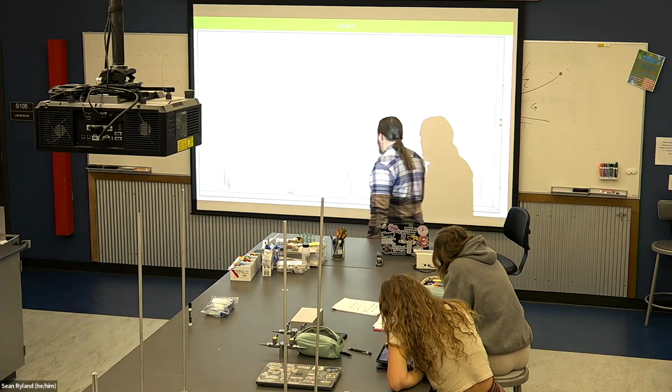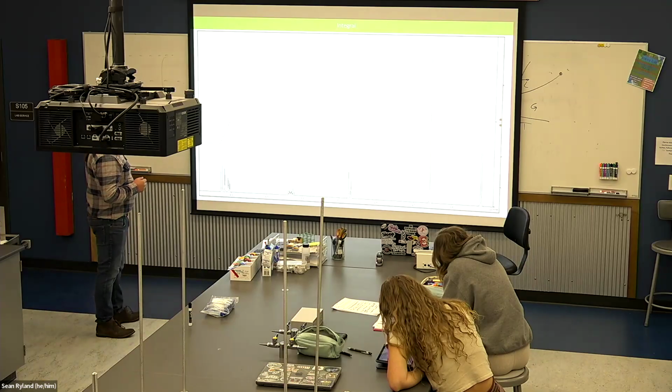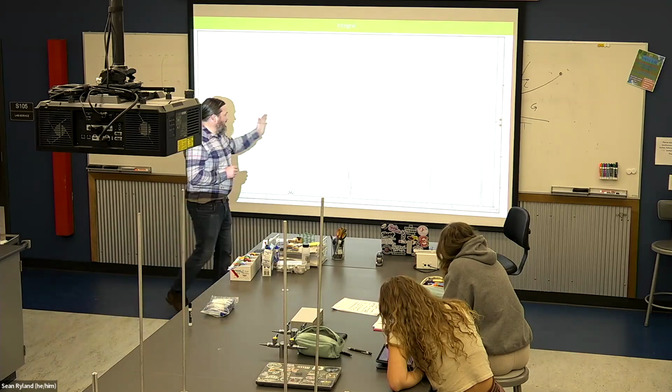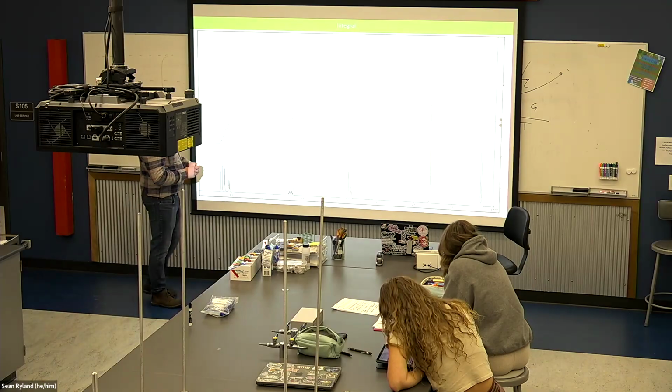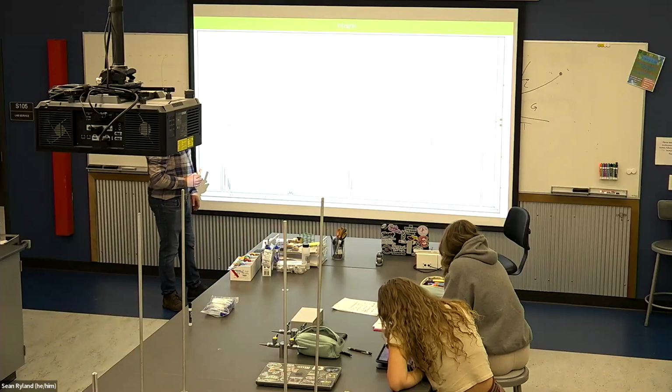And so here's another example. Another way that you see the integral is sometimes it'll just be shown as this red line for the entire thing, and you just look at it and say, okay, if I'm going to call that 1, that looks to be the smallest number.